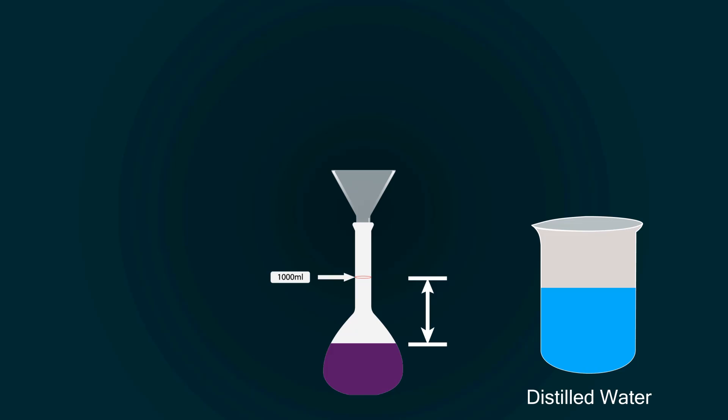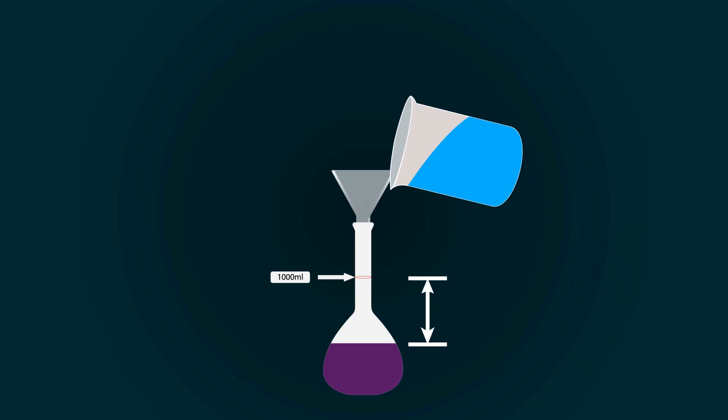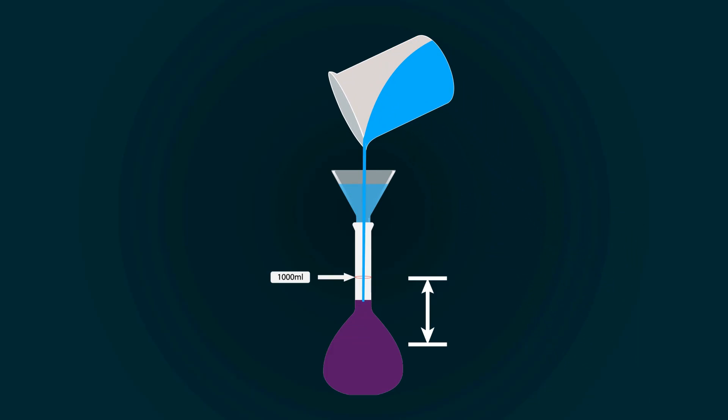So take more distilled water into an empty beaker and start pouring it into the volumetric flask.